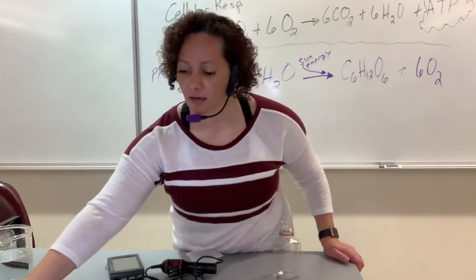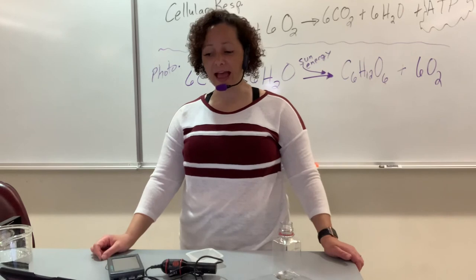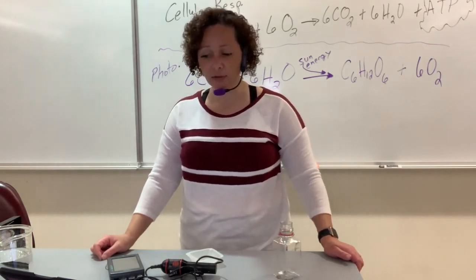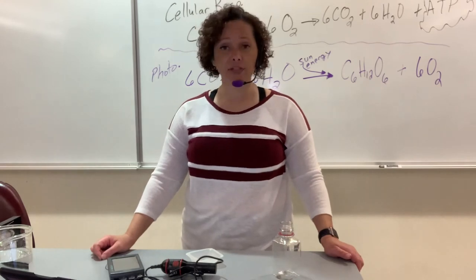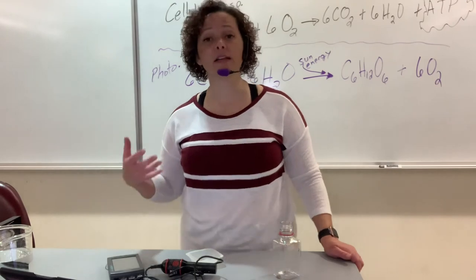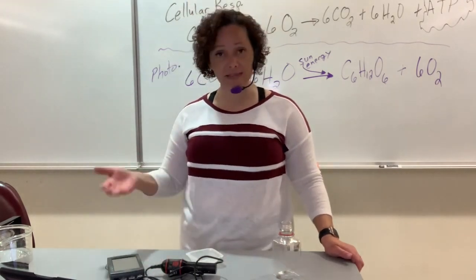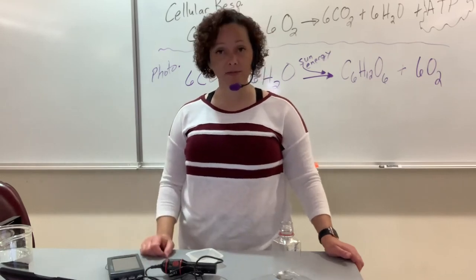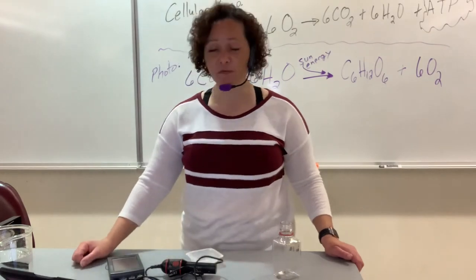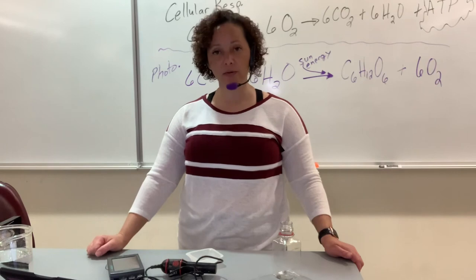Using the mass of the organism and the average slope, you are then going to calculate the average respiration rate. And the average respiration rate is just literally the average slope, which is parts per million per second. Parts per million is the measurement of how much gas is coming out, the CO2. Per second is time. Divided by the mass of the organisms. Okay, so that is your purpose of this lab, to figure out the average respiration rate of these organisms.